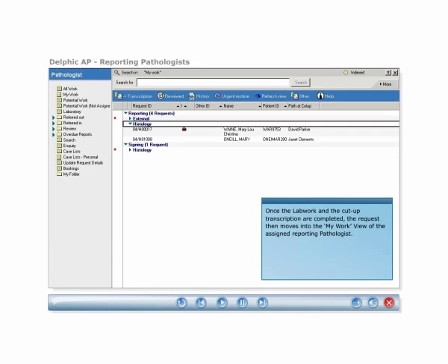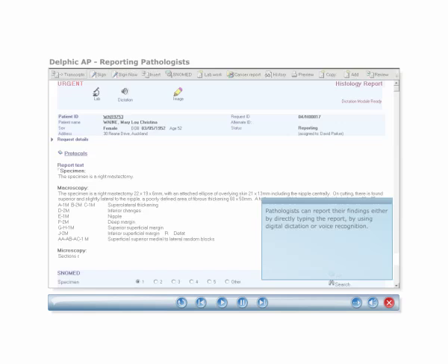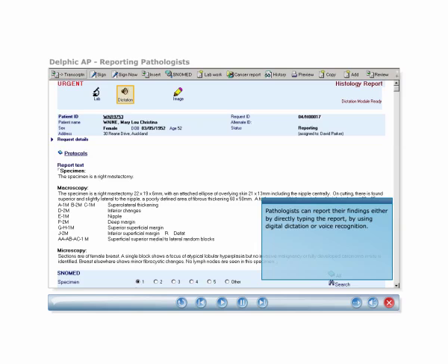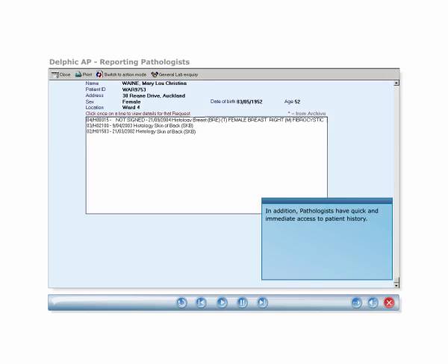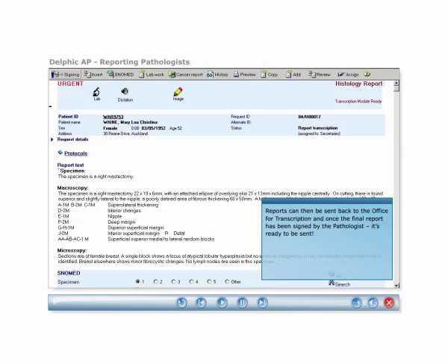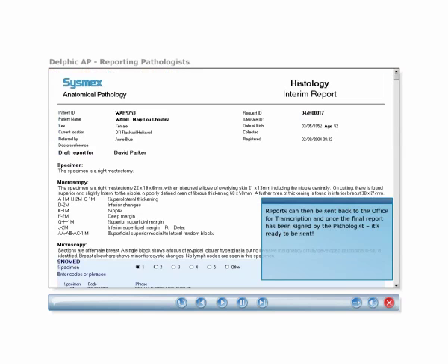Once the lab work and the cut-up transcription are completed, the request moves into the My Work view of the assigned reporting pathologist. Pathologists can report their findings by directly typing the report, by using digital dictation or voice recognition. In addition, pathologists have access to patient history and have the ability to add digital images of specimens and microscopy. Reports can then be sent back to the office for transcription, and once the final report has been signed by the pathologist, it's ready to be sent.